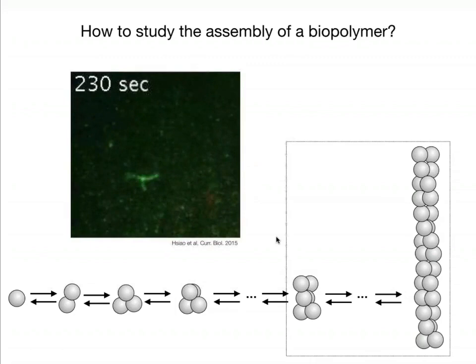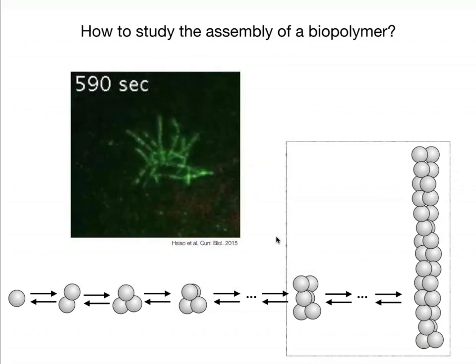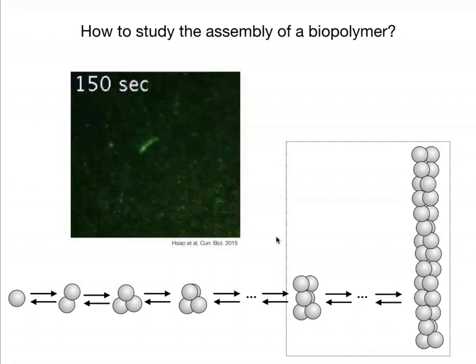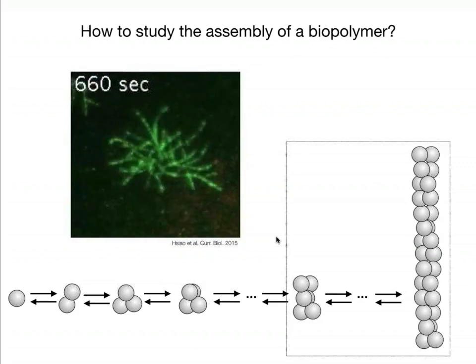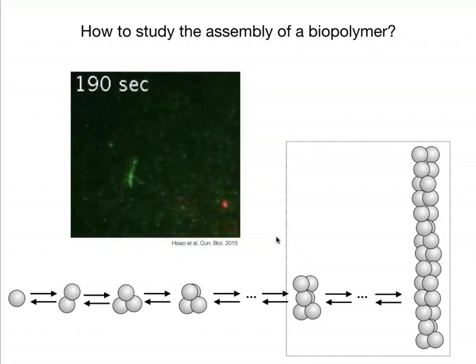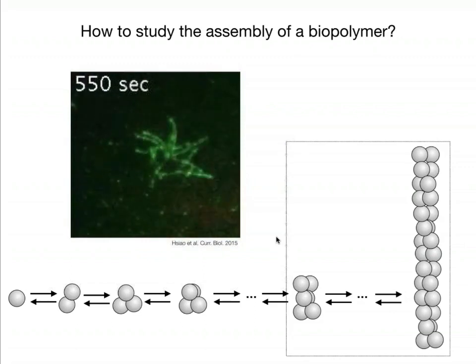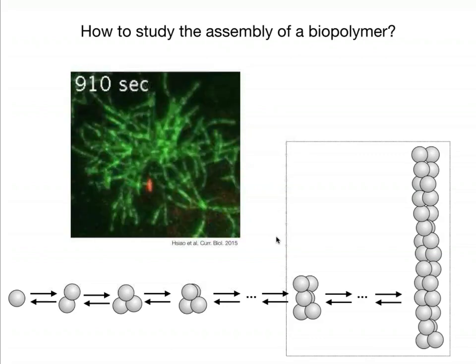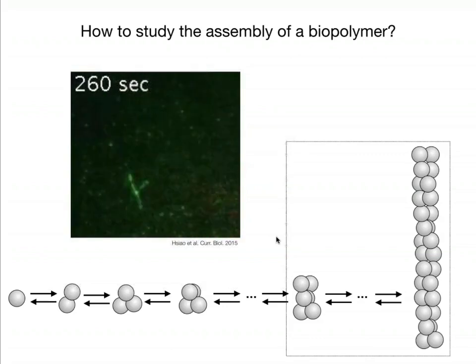One example in this video shows how a mix of actin with a binding partner called ARP2/3, which is an actin filament side binding protein, binds to the side of an actin filament and branches off a new filament, and thereby forms these dense actin networks, similar to the ones that are observed at the leading edge of a migrating cell. And from this video, you immediately see how this binding partner actually works.